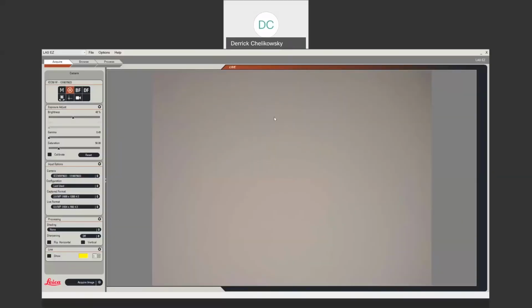Now our next one is going to be Nostoc, and this is not an alga. This is indeed a cyanobacteria. Specifically, it's a cyanobacteria that has a filamentous look to it and is encased in a gelatinous sheath. Now, cyanobacteria really means blue-green algae. It's often mistaken for an alga, but it is not. It is, in fact, a bacteria.